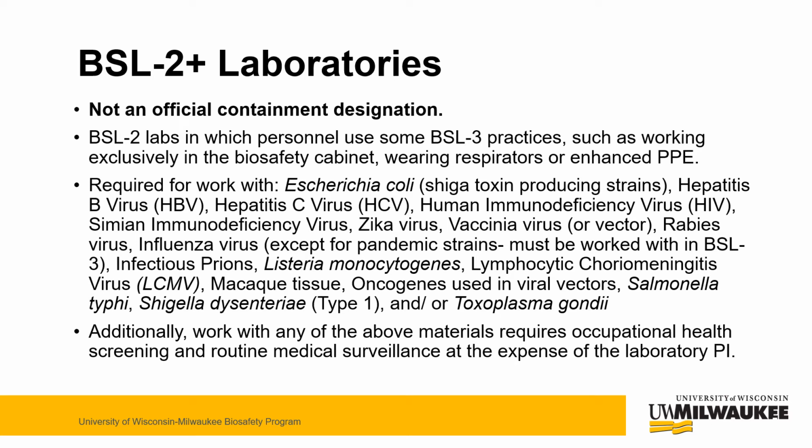There is also a BSL-2 plus laboratory grouping that is not an official containment designation. However, it is where people work in a BSL-2 laboratory, but they use BSL-3 practices, such as working exclusively in their biosafety cabinet, wearing respirators, or additional enhanced PPE.